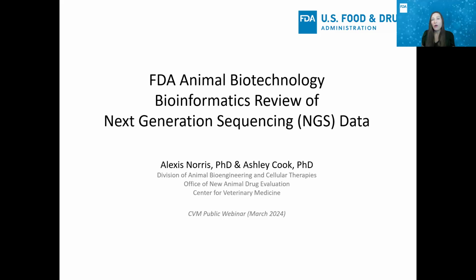Together, we will present an overview of the goals of our bioinformatics review of next-generation sequencing data, abbreviated NGS, in support of the molecular characterization of intentional genomic alterations, abbreviated IGAs, in animals, and the process for electronically submitting NGS data using FDA's precisionFDA platform.